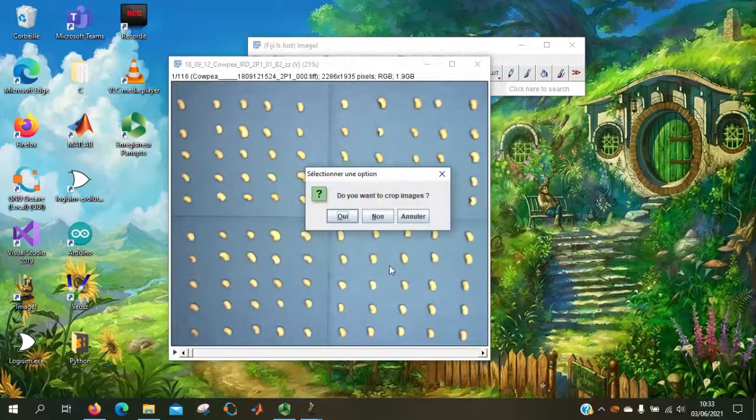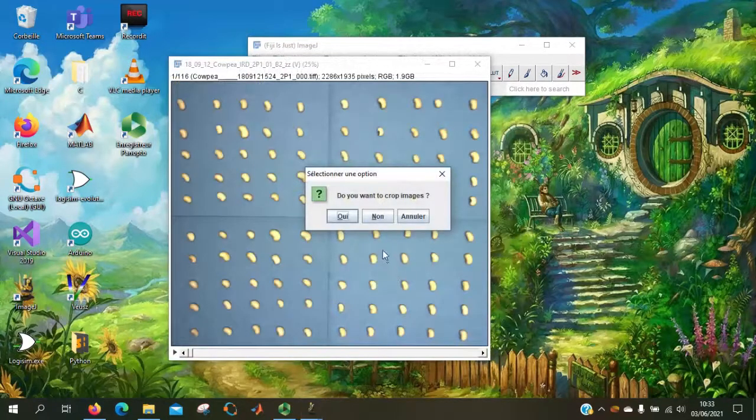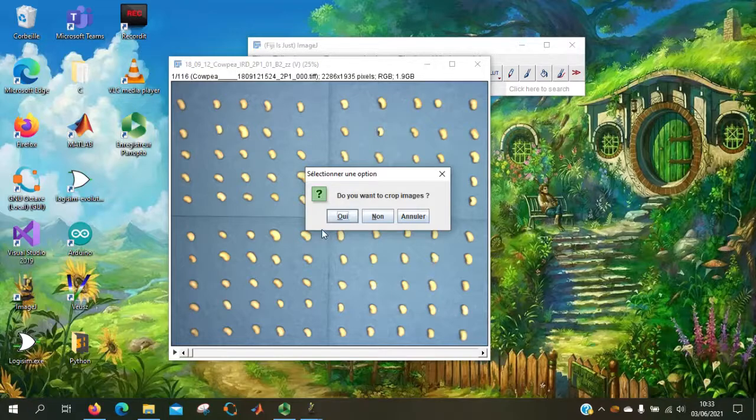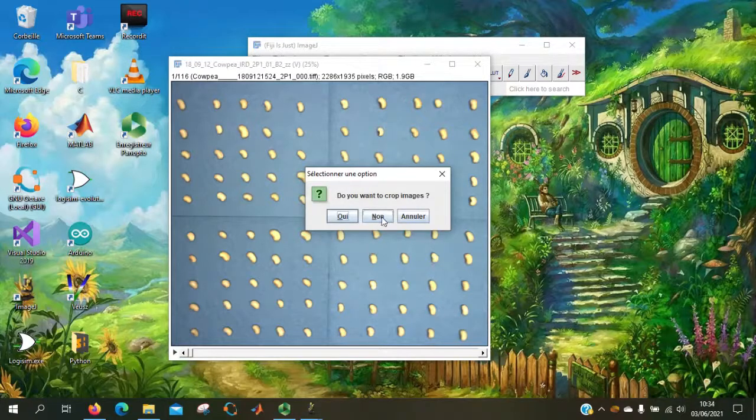Here it asks the user if he wants to crop the image. Here we will say no.